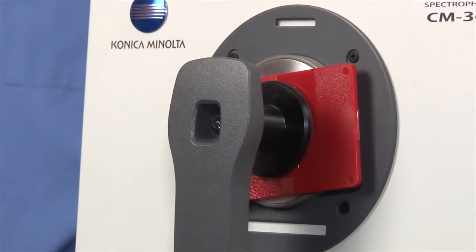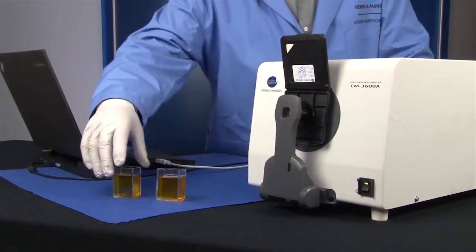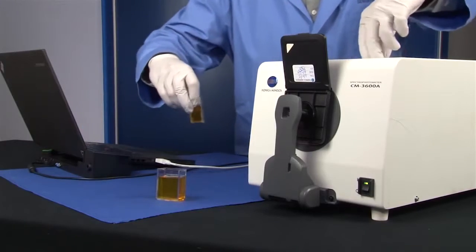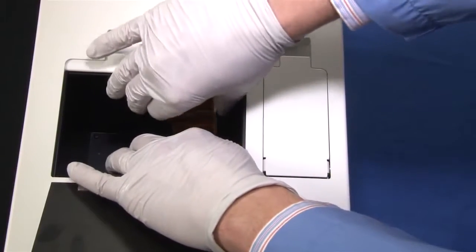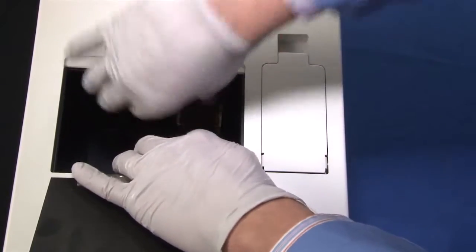The CM3600A measures solid or liquid samples in reflectance or transmittance mode, offering great flexibility for various samples ranging from opaque, translucent, and transparent.